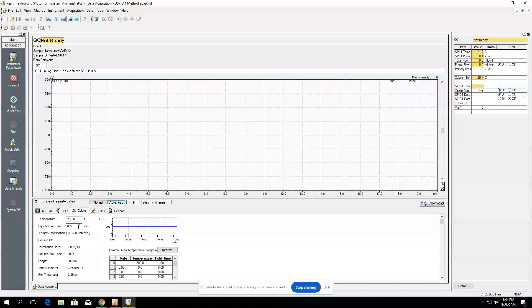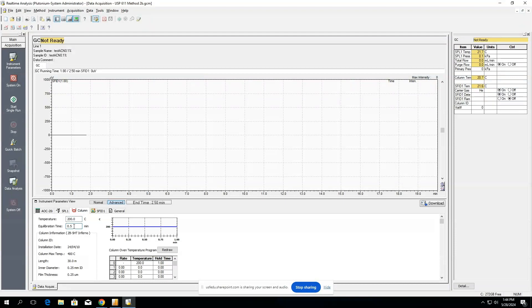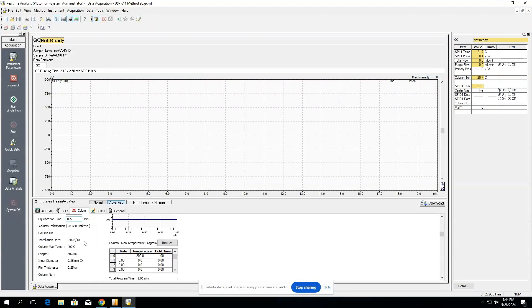This equilibration time is going to be the time between injections that it's minimum going to wait to allow the column to reach equilibrium. Depending on what you're flowing through your column, you might want to give more or less time for whatever might elude to fully elude out. If you try and run too much in too short of a time window, you're going to overwhelm the column and you're going to have issues. So make sure that this value is the perfect sweet spot between taking too much time as well as enough time so that the column can fully clean out in between each run.